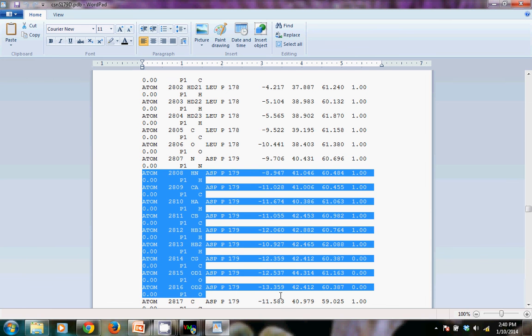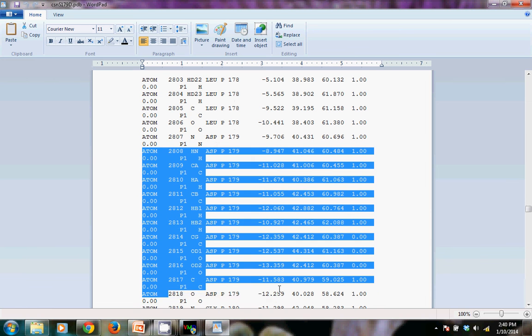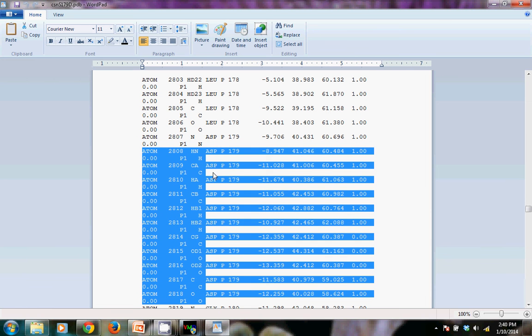So residue 179 aspartic acid. You can check that it's actually the correct atoms. I've never had a problem with that.